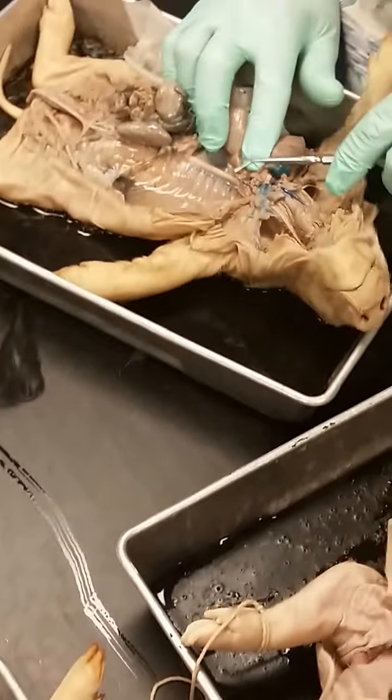Then here would be the anterior vena cava, and then right here, the posterior vena cava. Everybody see that? Then, you see that white thread? That white thread comes down, and you can see it kind of spreads out over the surface of this flat sheet of tissue. What is this flat sheet? That's the diaphragm, so that means that this has to be a nerve, and that is the phrenic nerve right there.